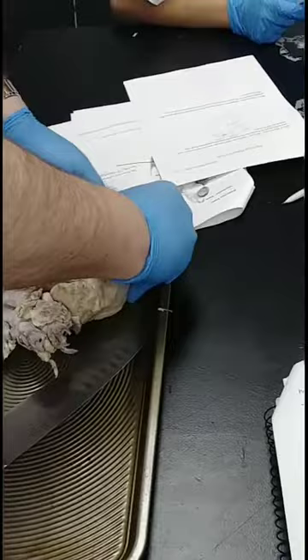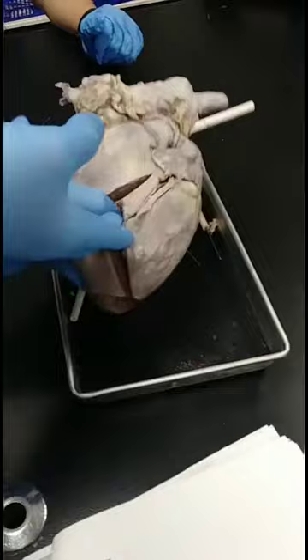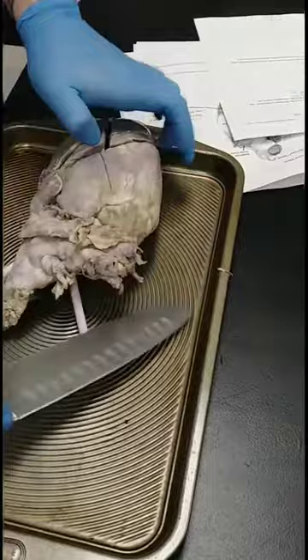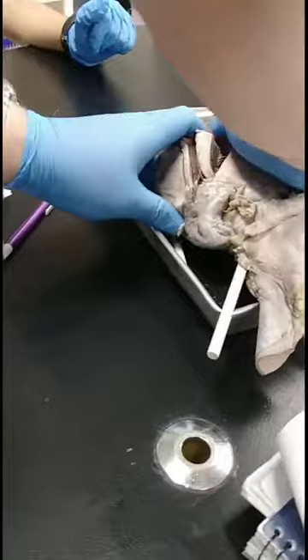which you can see. It continues into here. Make sense? Then we'll go up into this atrium up here. This is the auricle covering the atrium, right? So what we want to do is cut up here, so you open up the right ventricle. So now you have the right ventricle. That's the wall thickness. Compare it to the thickness on the left side. See that? Okay, so you try cutting a little bit.